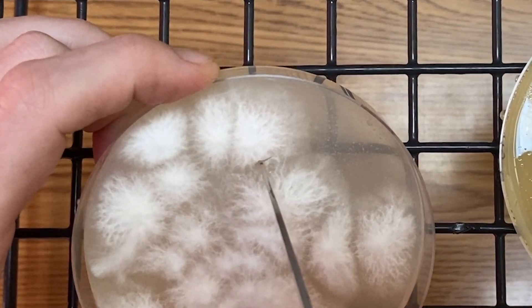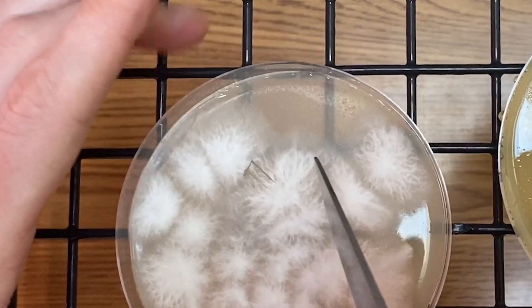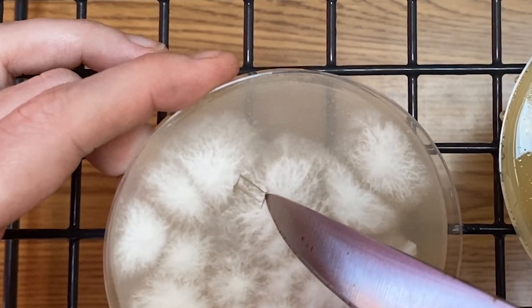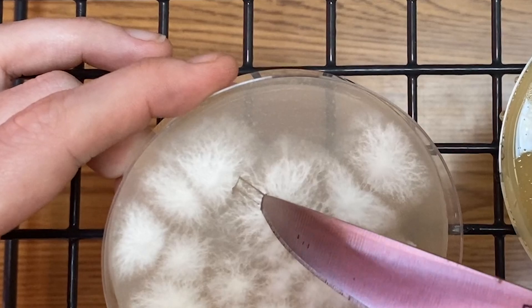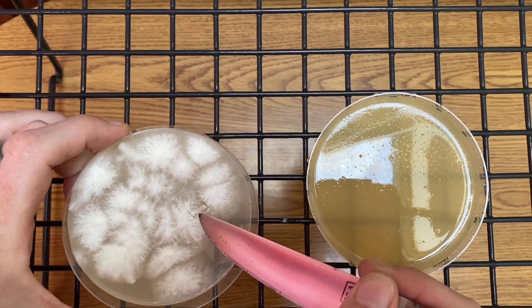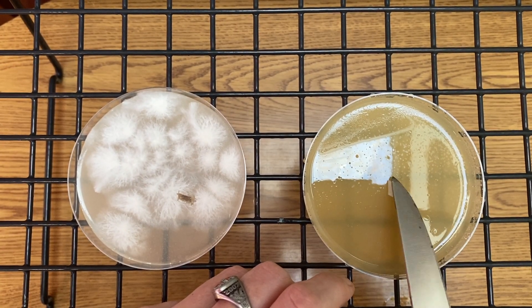Here I chose the strand that had grown together from two rhizomorphic sectors, and I tried to choose the thickest, strongest strand that had intertwined and connected together. Then you just simply cut the agar from the petri dish and transfer it to a new petri dish.